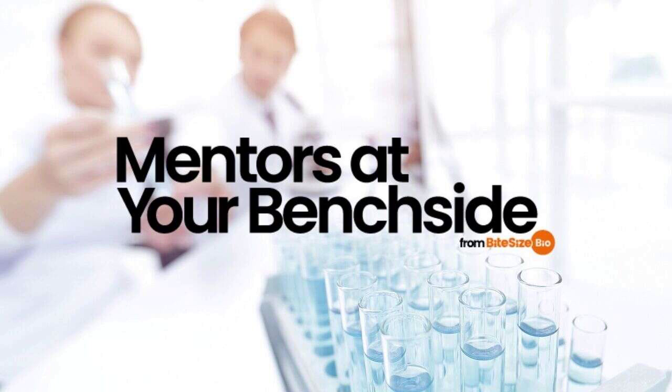Caution: it is not always a pellet. Sometimes with fixed angled rotors, the DNA may not always form a nice tight pellet at the sidewall. It can sometimes smear down the side of the tube. For this reason, I always use my resuspension buffers to wash down the side of the wall above my pellet to make sure I solubilize every molecule of plasmid that may be present, even though I can't see it.